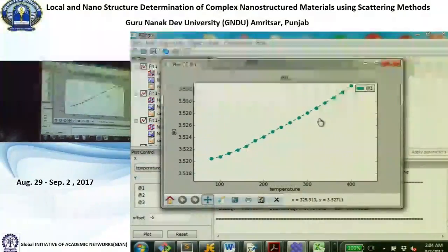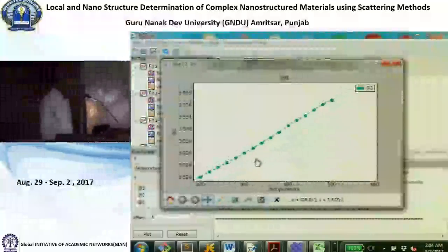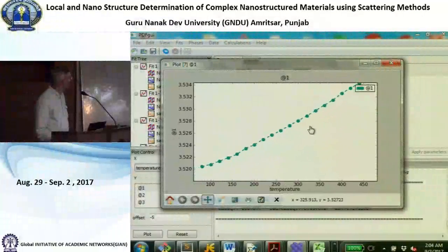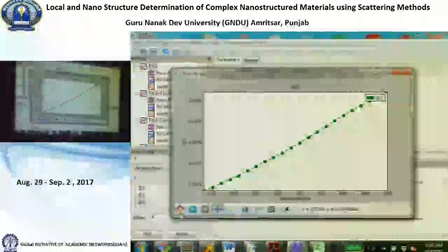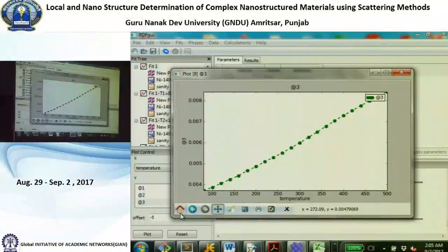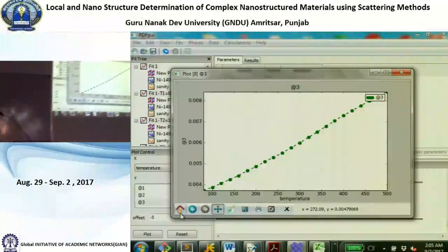Actually, this was the thermal parameter, and what you see is that it's fairly linear in the high temperature region, but it curls over in the low temperature region. This is very characteristic. The thermal factor down here would actually go up there, but this is deviating upwards from that. And the probable reason for that is actually anharmonicity from your data if you're careful.